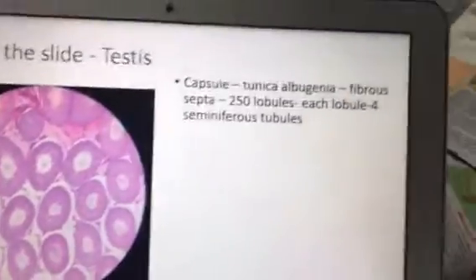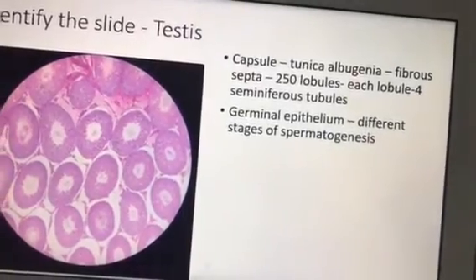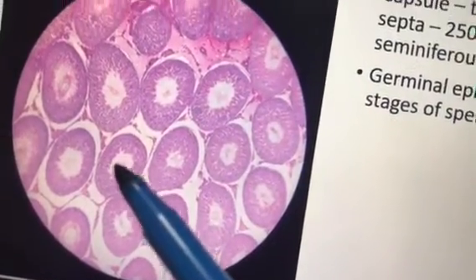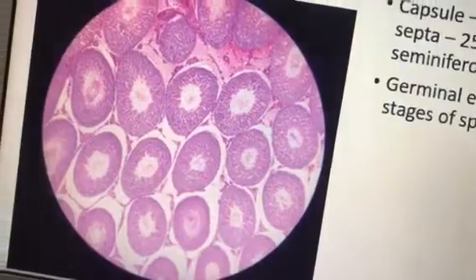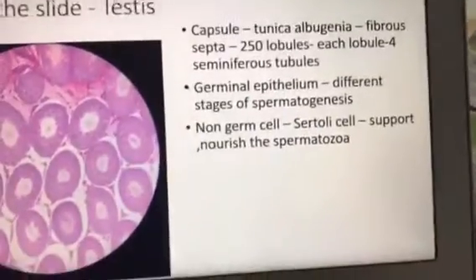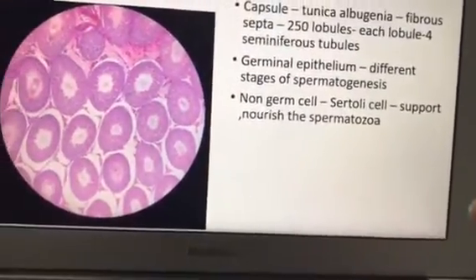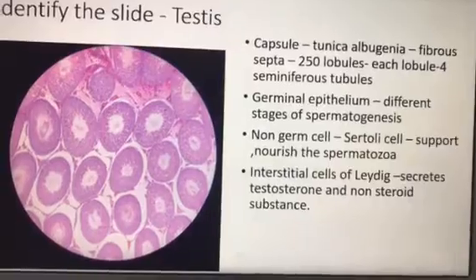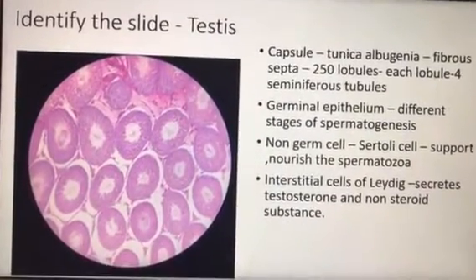In between the cells you have interstitial cells of Leydig, which produce testosterone (a steroid) as well as non-steroidal hormones. The germinal epithelium shows different stages of spermatogenesis with the spermatid at the tip. The non-germ cell is the Sertoli cell, whose main function is to support and nourish the spermatozoa.